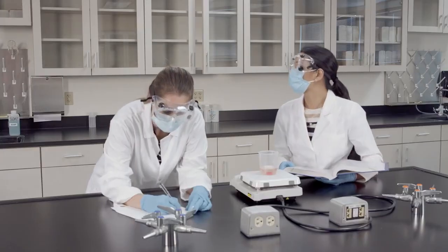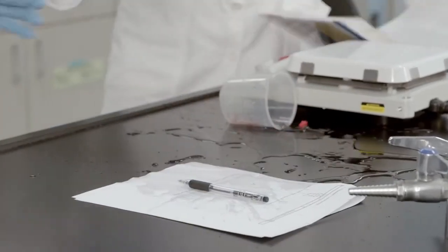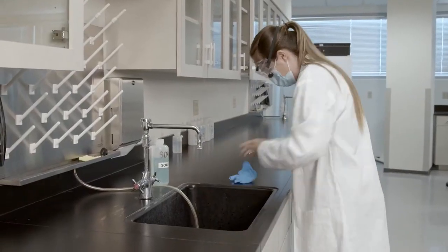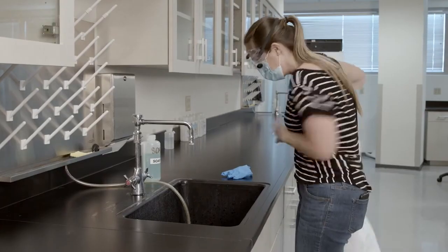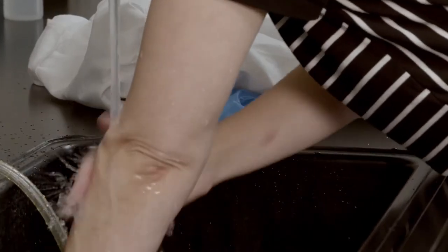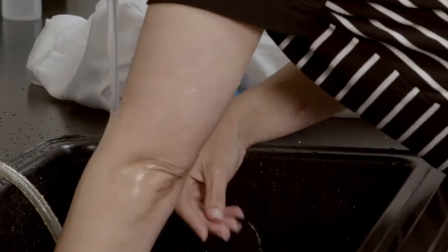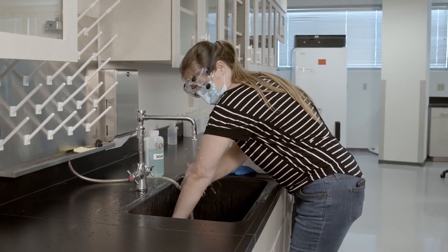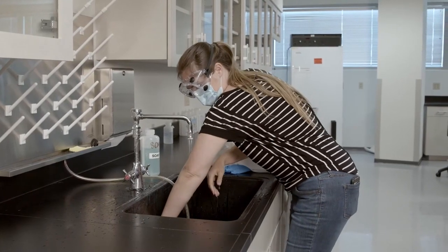In the event of a small splash to your arms or hands, you should remove your lab coat and go to the nearest sink to flush your skin with water for 15 minutes. Have someone check the SDS to determine if any further action is required based on the chemical or hazardous material. And always alert security to any exposure of a chemical or hazardous material to document the incident with an incident report.